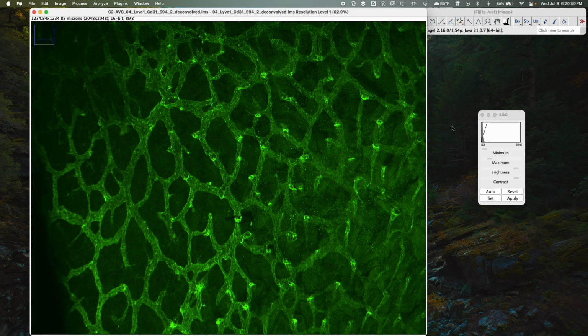And this doesn't fit my screen fully. My screen isn't big enough to hold it. So what we can do is zoom out on the image so we can use this and scroll up and down to see if the lacteals here are being shown or if they're being dragged off.